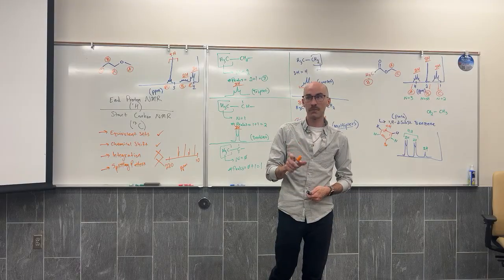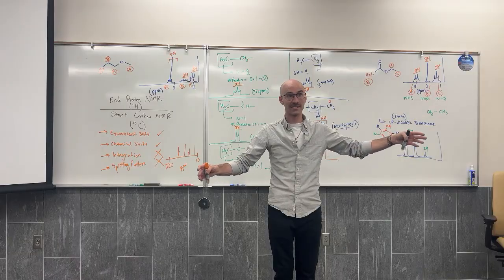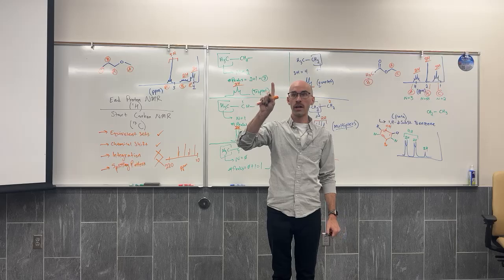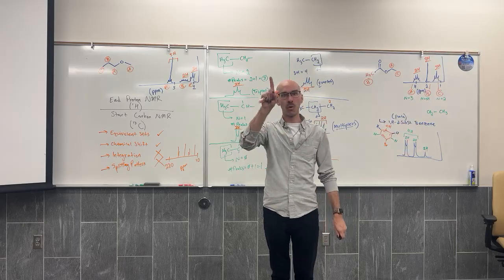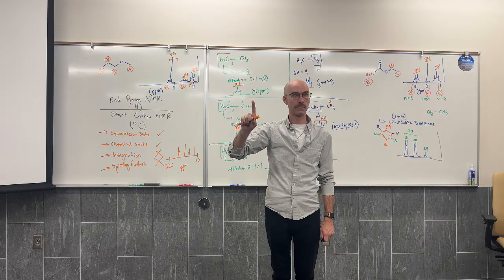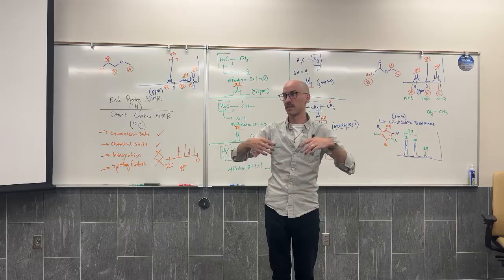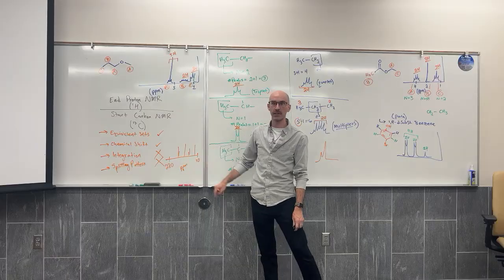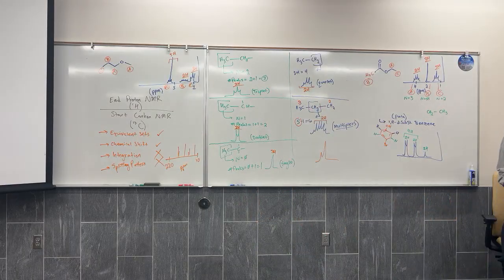So when you analyze a sample for its carbon NMR, you often have to run very long scans, because for every 100 carbon atoms, only one carbon is actually responding to the NMR and giving off a signal. So you have to take more scans, longer scans, to pick up enough detail to get a nice clean spectrum.